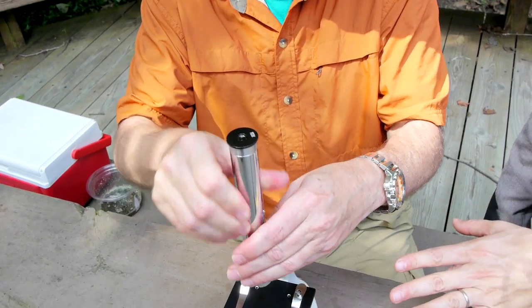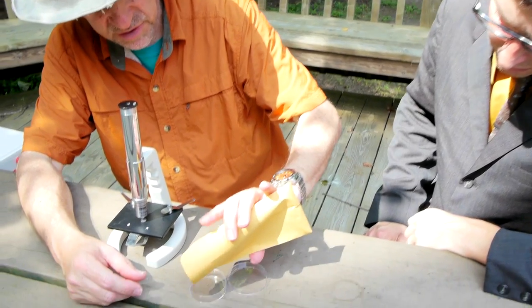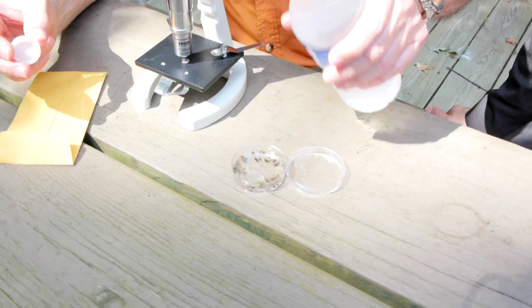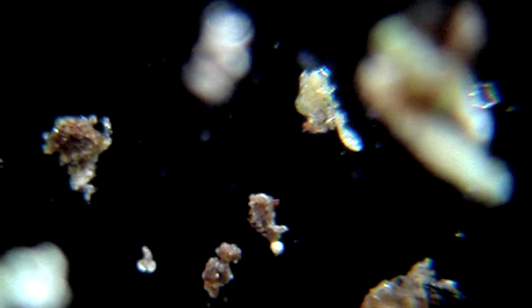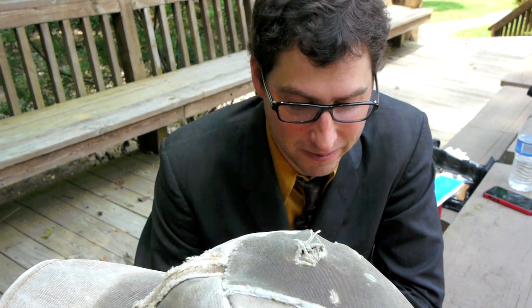Now, to part 2 of the hunt. Enter the microscope. The hunt doesn't only take place in the forest. It's right here. Mike pours out some of our sample into a petri dish. Then he adds water to rehydrate the sample. We let it soak in water for a couple of hours. Now he'll use a small flashlight to shine across the petri dish, which helps illuminate what he's seeing. Then, carefully, little by little, Mike turns and shifts the petri dish until he finds the tardigrade lurking in the debris.